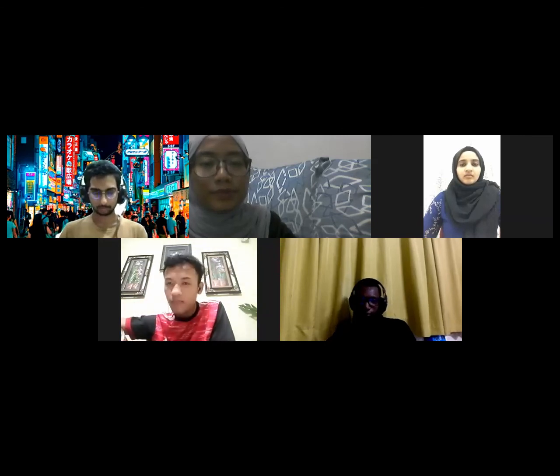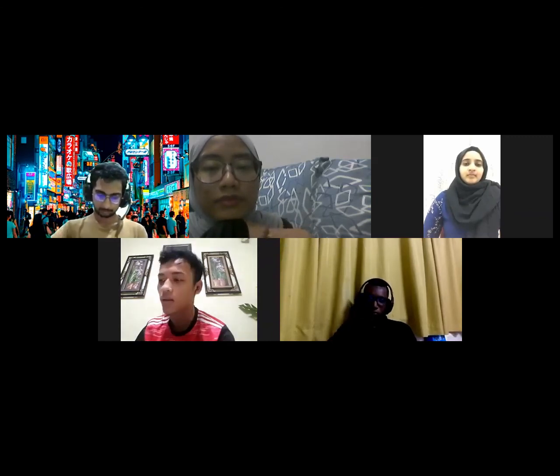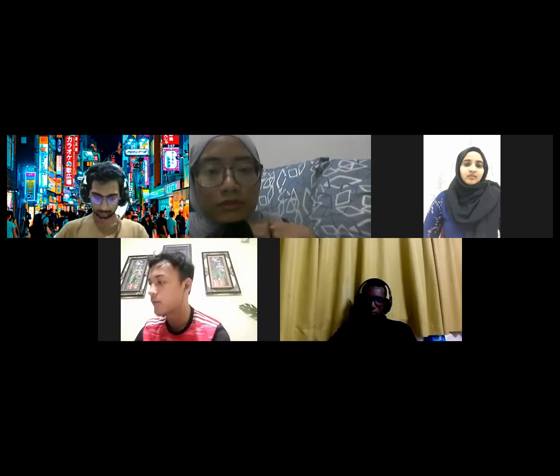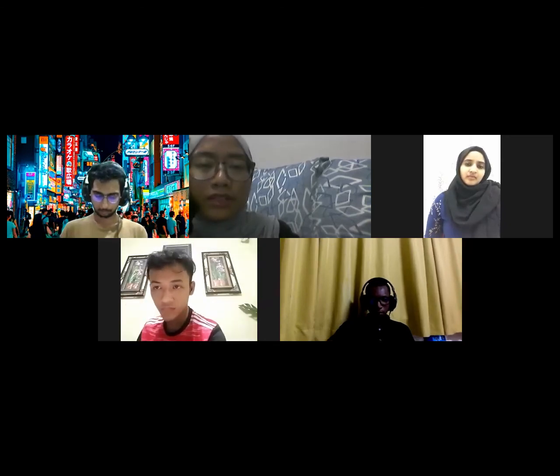Shafi, you want to add anything? Maybe if our primer does not reach the optimum or the best GC or TM, maybe we can try to add or delete some of the nucleotides to get the best primer. All right. Yeah, I agree. We can take it from the developer sequence itself. Either you add one or you minus one. One or two, depending within the range of the PCR primer length.